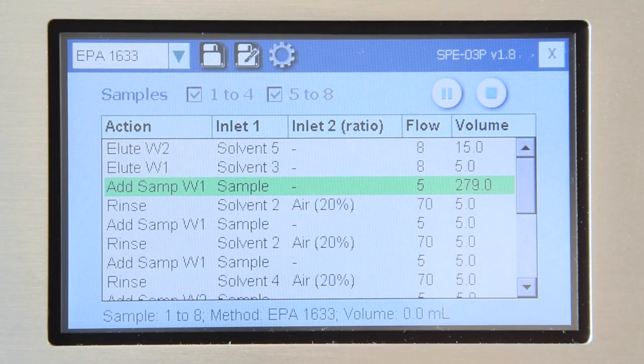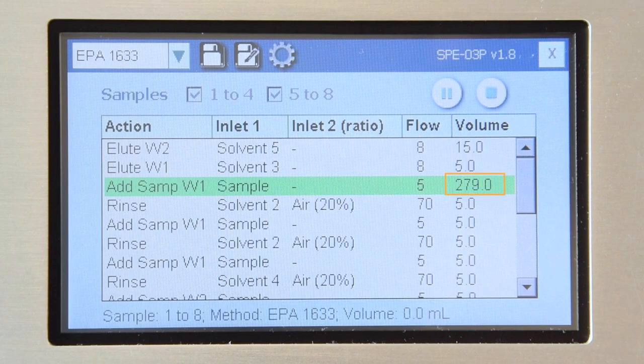Fortunately, that's no problem at all for the SPE03. You can simply program a volume that's slightly larger than the actual sample volume. In this case, these 250 milliliter sample bottles can only hold 279 milliliters at maximum, so we programmed the step to add 279 milliliters. And if you had to estimate, how long would a full extraction take?